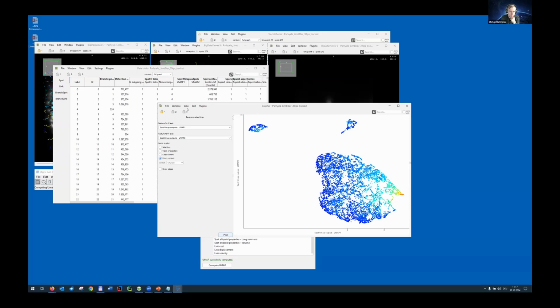That's possible to show here as well in combination with the UMAP. So you could find, for example, if there was a feature that particularly makes this thing a cluster on its own, you could use a color coding for that, and you could try to see if that color only occurs in this cluster.